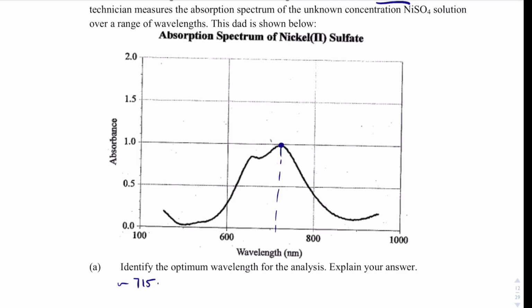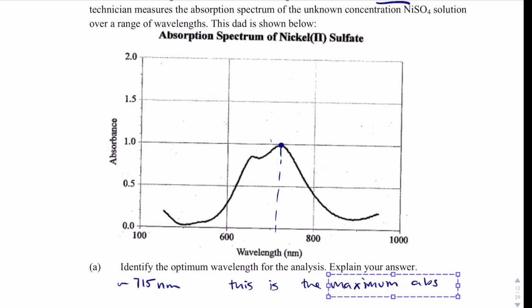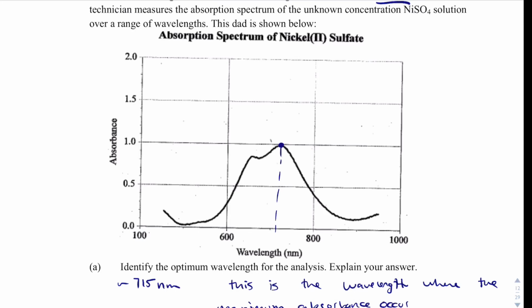I'm going to say about 715 nanometers. This is the wavelength where the maximum absorbance occurs.